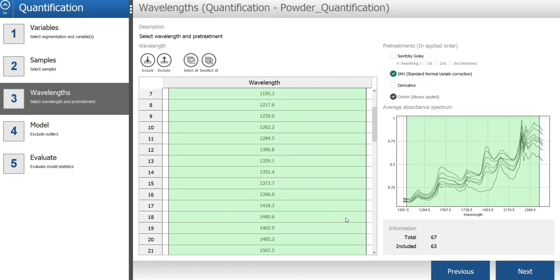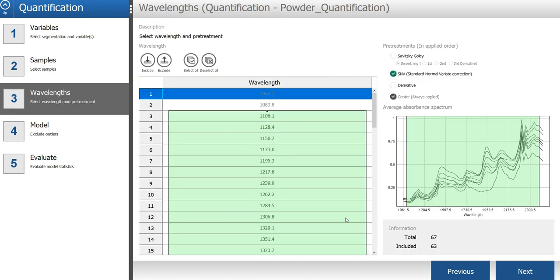In this step of the wizard, you can select what spectral bands or wavelengths you want to include in the model. The view you see here on the right side is the average spectrum for each sample.